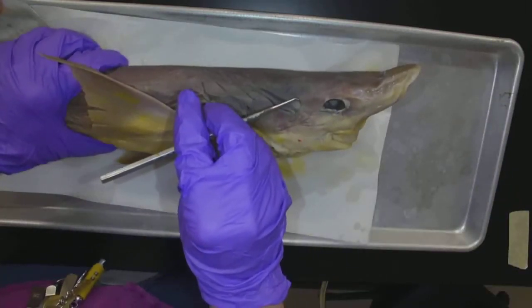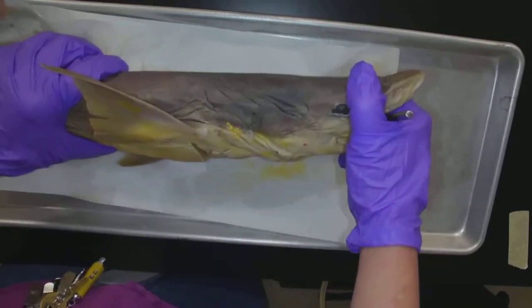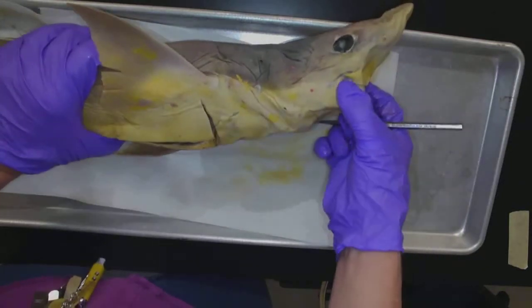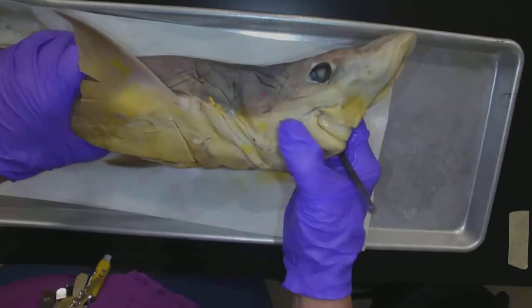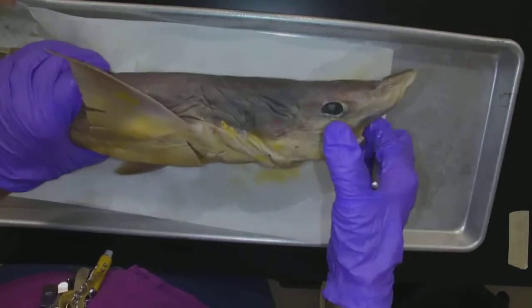We have the spiracle, which is an opening behind the eye — you can see how the probe goes in there, it is an actual opening. Here is the mouth, the business end. We can see some teeth in there, and I could probably cut myself on these teeth if I really tried.